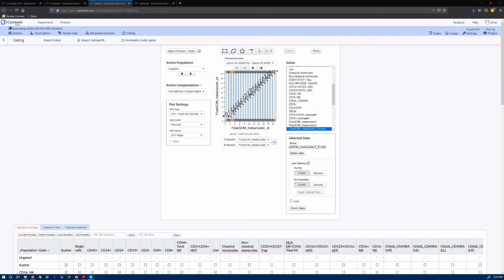I see. Thank you. So the impact of the number of events on the algorithm, the clustering outcome, is measured as something called stability. Based on how many events you run, if you run a lot or a little, do you get basically the same results? Does that number impact it? And FlowSOM is very stable to changing this event count. So that's number one, and number two, the viSNE we're just using for visualization.